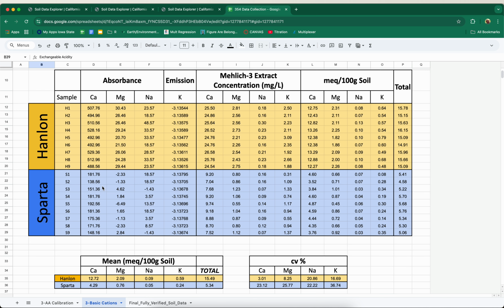We're going to do a lab on calcium carbonate equivalent, basically looking at the quality of different liming products and how they can modify the relationship between the soil and its ability to hold on to the various constituent nutrients that are of interest to plants and in turn us.